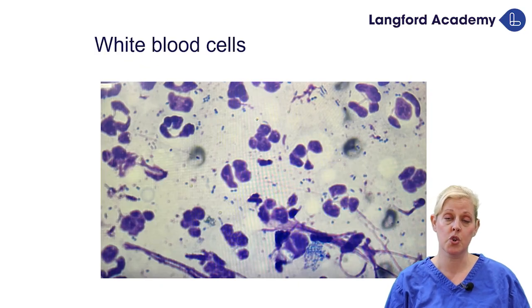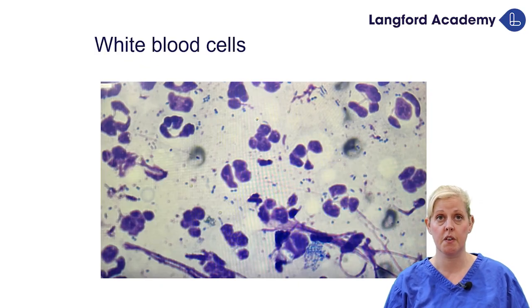I know I've talked a lot about dogs, but the same information does apply to our feline friends, that you will find more of those pinky granulated white blood cells than you maybe would on a dog. There's also some cocci and things down on this slide. You can see a fairly big bunch down at the bottom there.